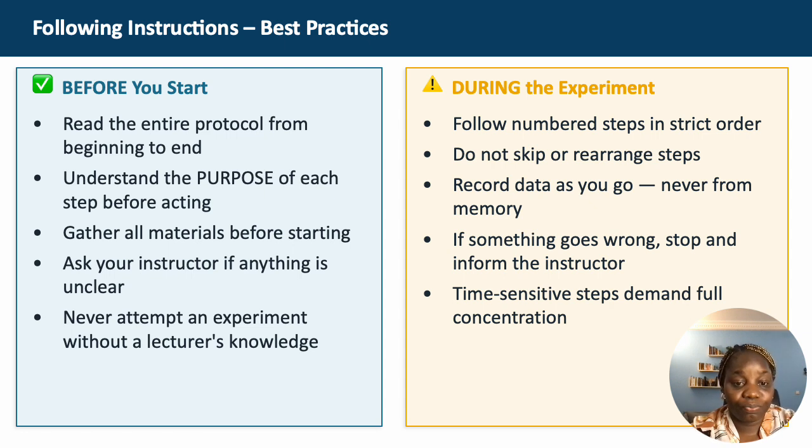Then some of you don't read the protocol, and midway through the experiment, they will discover a step that requires something they did not prepare, and this is where you start failing the experiment. I always advise reading the protocol the night before, even 2 days before the practical.